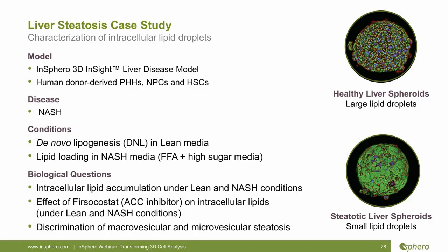And we were interested in this last point as the presence of microvesicular steatosis can be used in the scoring and clinical assessment of NASH severity, and it's also thought to be a prognostic indicator.